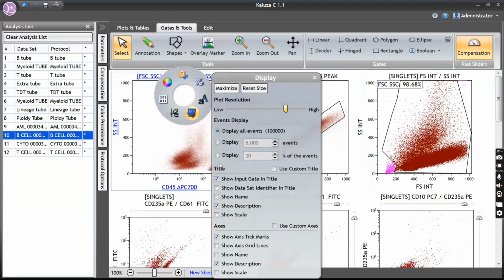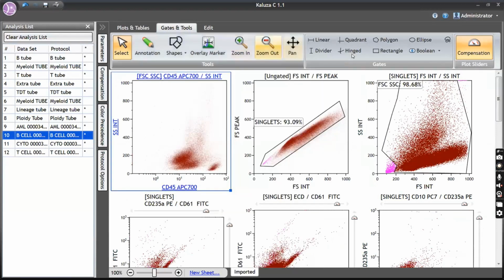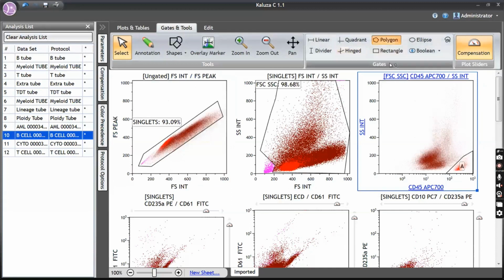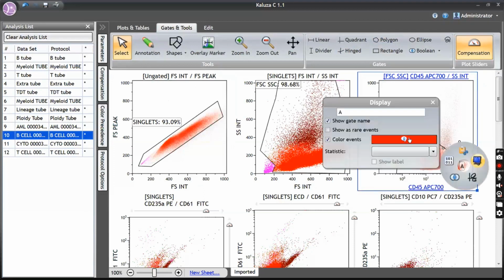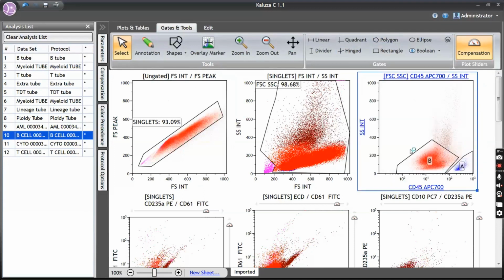Again, you are finding the 2 clusters and lymphocytes. So I'll just gate the lymphocytes. So singlet. From this, they have an ungated singlet gate. Singlet is being applied here. So this is FSC SSC. They have applied it here, so it comes like this. Okay. So just gating the CD45 dim to negative region. That is the blast gate. I'll give the population the red color, and this I'll give the blue color as we commonly give.